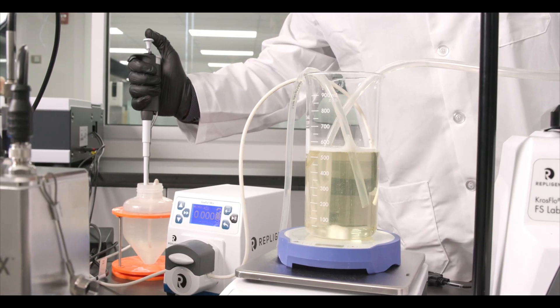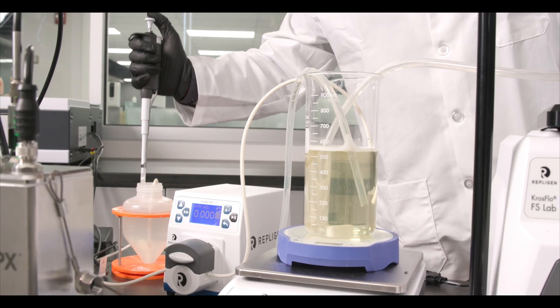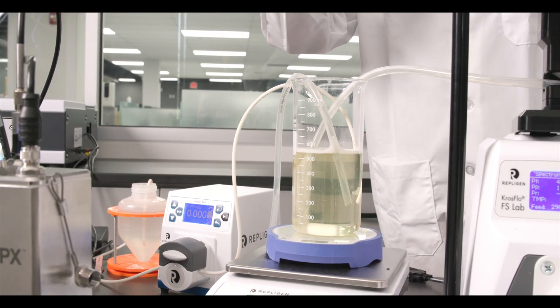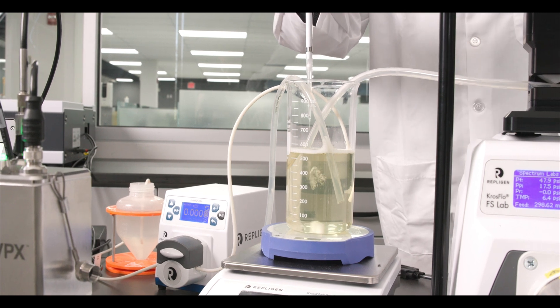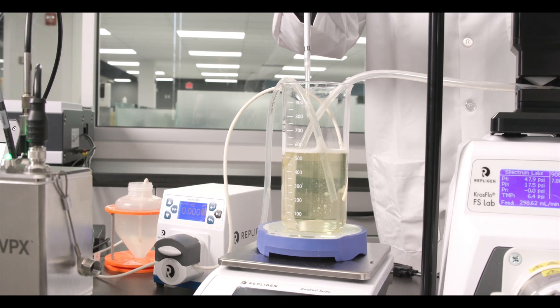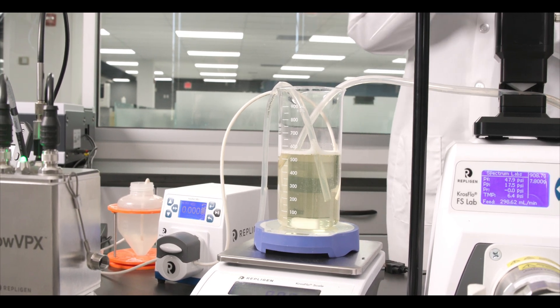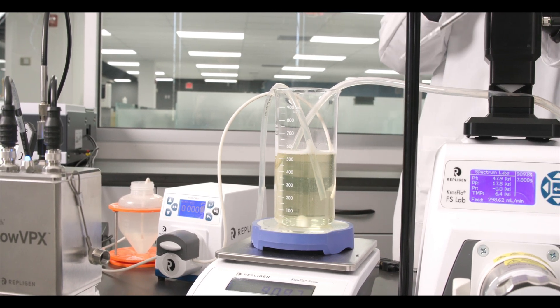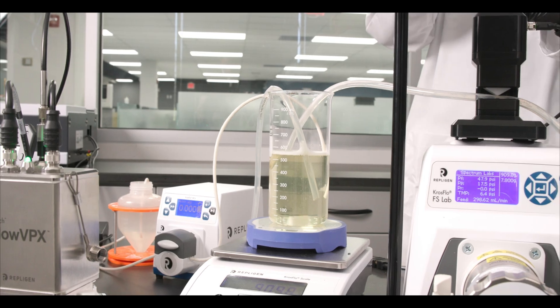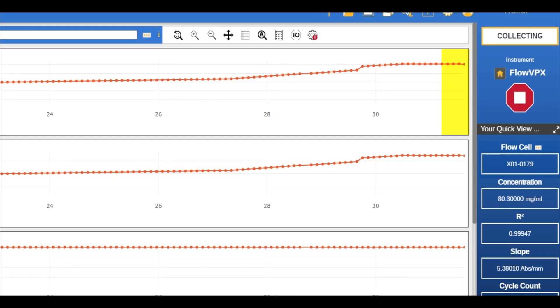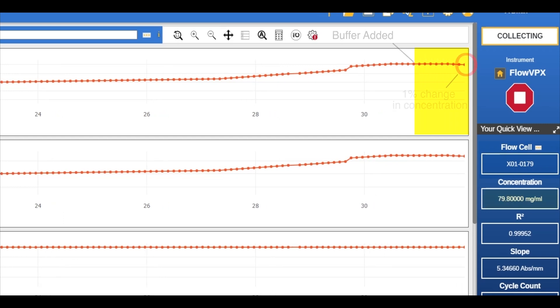We can demonstrate the sensitivity of the FlowVPX system by adding one percent of the current volume to the retentate vessel and tracking the one-to-one change in concentration reading. For this test our starting concentration is 80.7 mg per ml. After recirculation of the solution with added buffer the FlowVPX system records a concentration of 79.8 mg per ml.